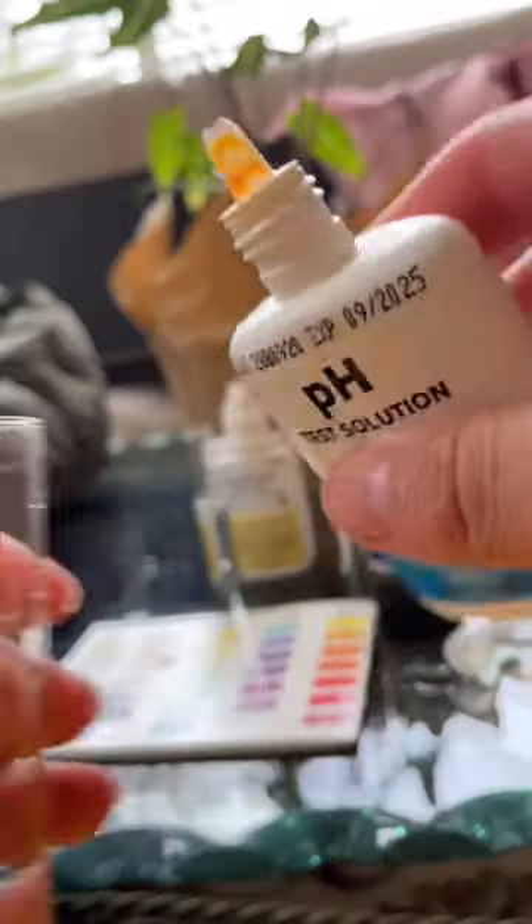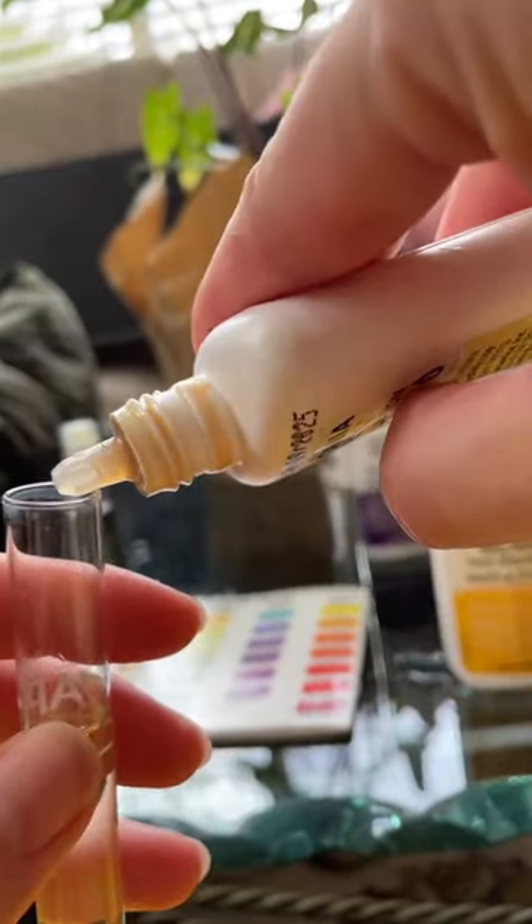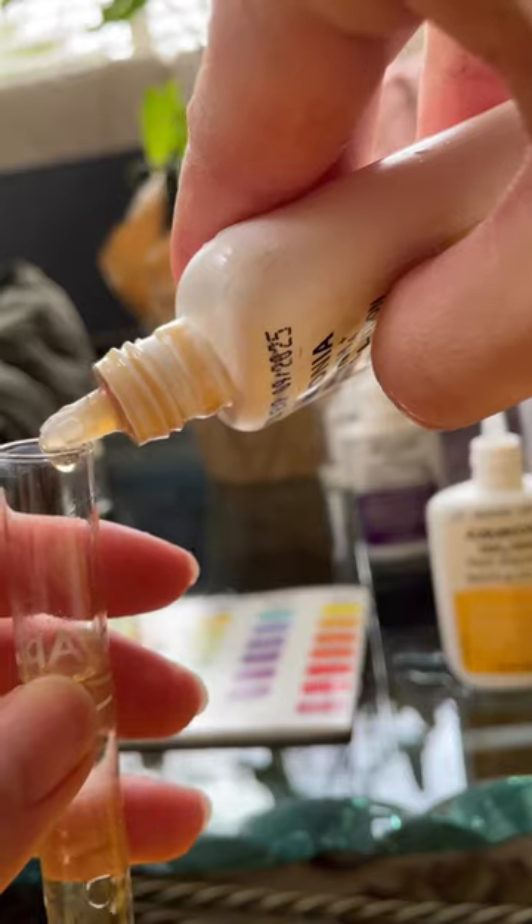Gotta collect the water sample first, of course. pH first because it's easiest — three drops. Ammonia next, eight of each bottle. Okay, bottle number two.